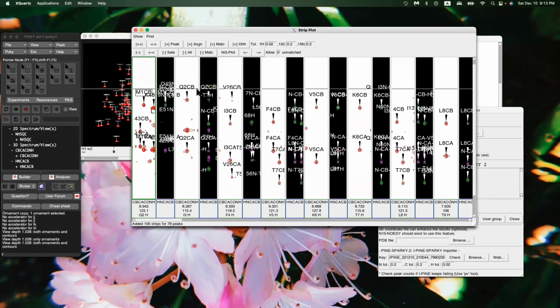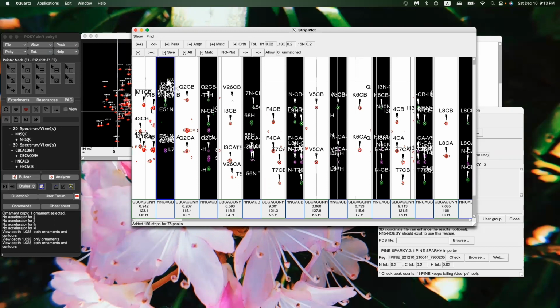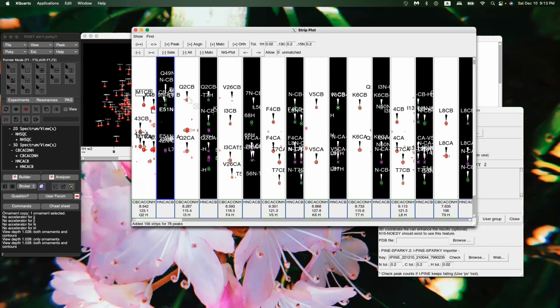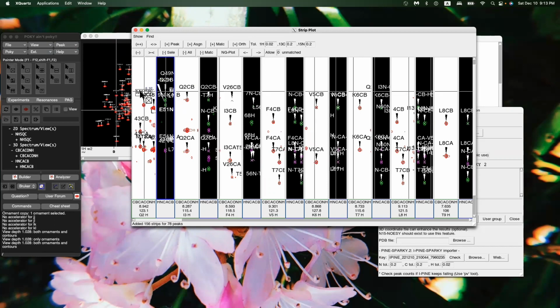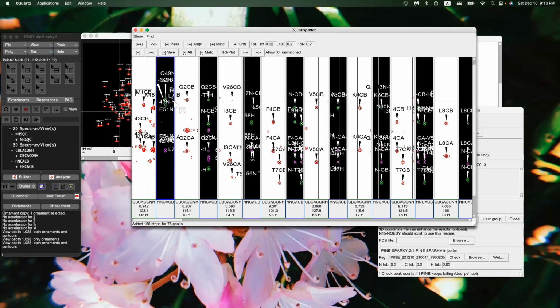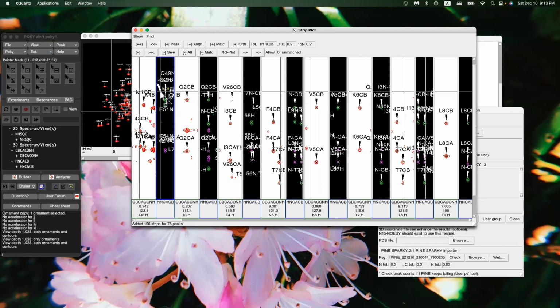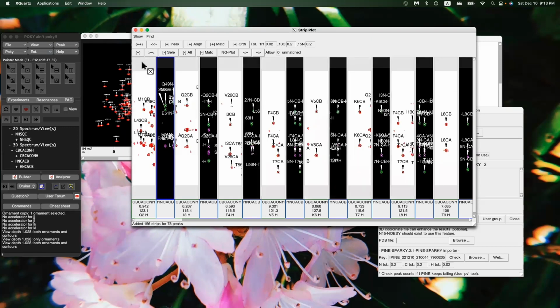So we can double check. It's a little bit hard to see because they're all a bit overlapped, so you can move the labels around to make sure. It's the same thing as before. You're basically checking to see whether or not this peak is in. So we're looking for this peak right here.